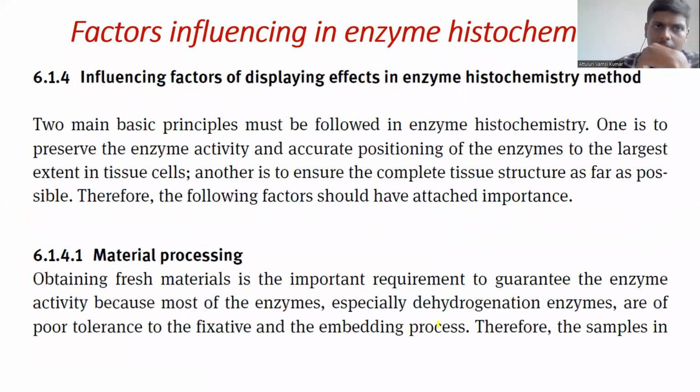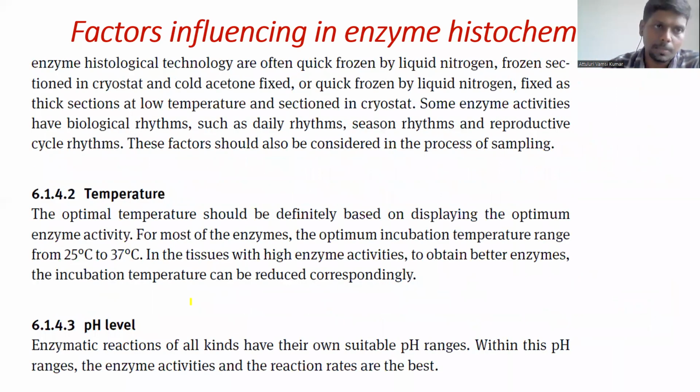So there are certain factors in enzyme histochemistry. Keep in mind, now I'm going to discuss the factors contributing in enzyme histochemistry. I'm not discussing factors of normal enzymes, and I'm not discussing this from the view of biochemistry, but from the point of enzyme histochemistry. Some factors contribute to lack of coloring or lack of report generation, including material processing. If we haven't unfixed after fixation, if we are not removing crosslinks properly, there is a possibility of not getting any results. So that is one factor.